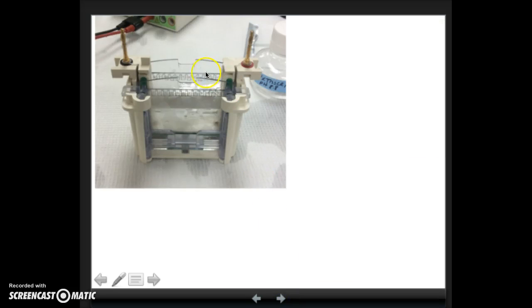So you take those gels. Our particular apparatus can load two gels. You put two gels in this chamber facing each other with the short plates facing each other. Then you can pour buffer between those two gels so that it goes over that short plate and into the wells and makes contact with the top of your gel.